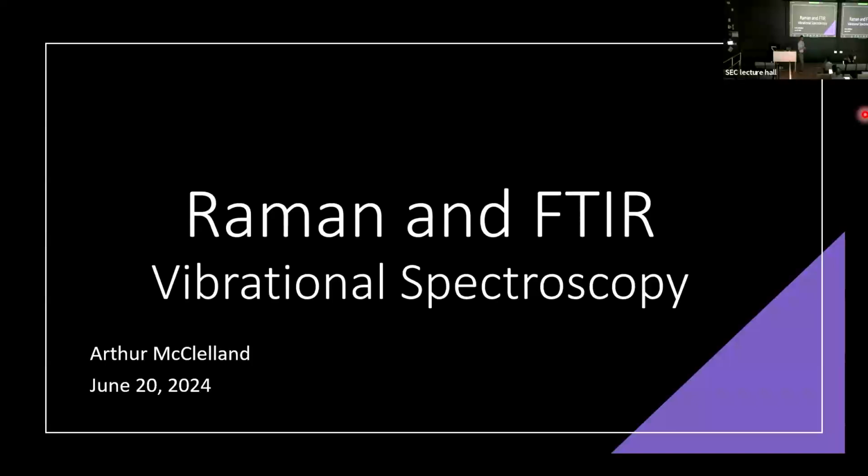Today, I'm going to start by talking about two different optical spectroscopy techniques. These are not all the optical spectroscopy techniques I do. It's just what I can feasibly fit into an hour. So if you have anything that involves shining a light on a sample and getting information back, feel free to reach out and chat with me.